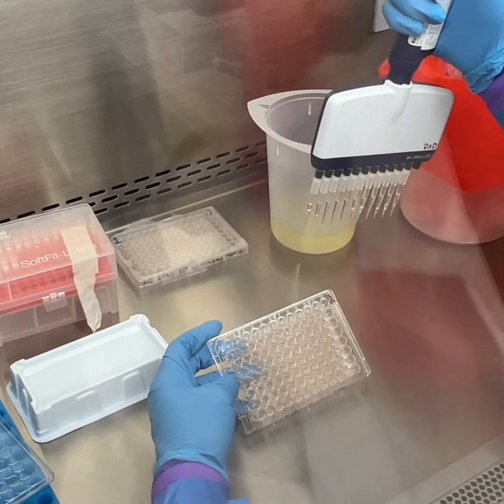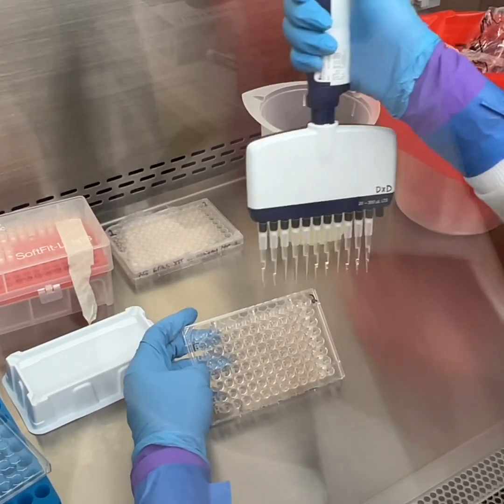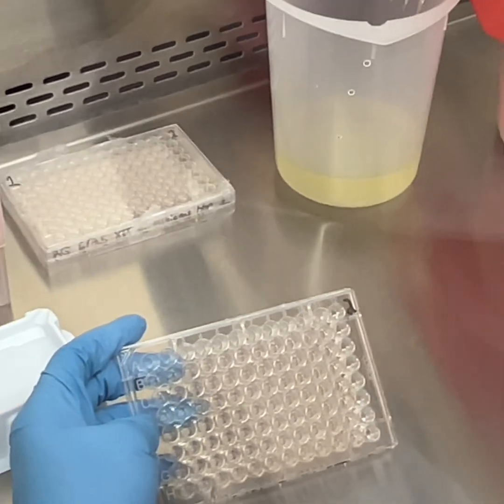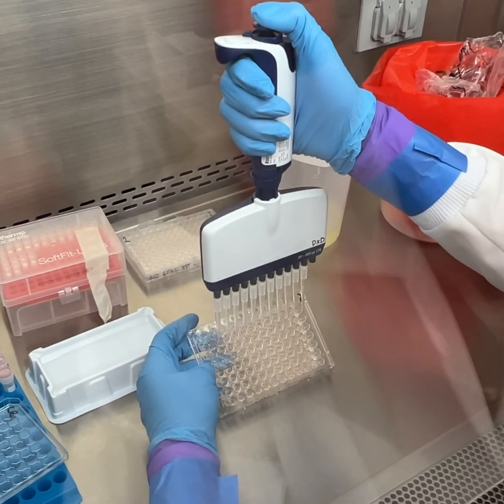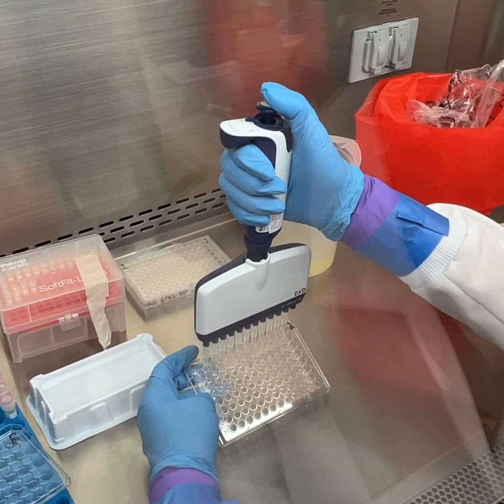Some of them are going to have more, some less, just due to evaporation, so get as much as you can. You can see the biofilms there. Look at 12 compared to 1 through 10. Squirt into your bleach, touching the same spot.